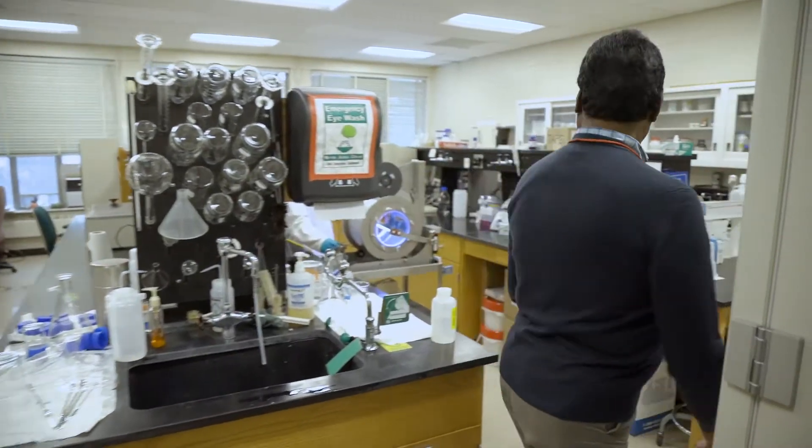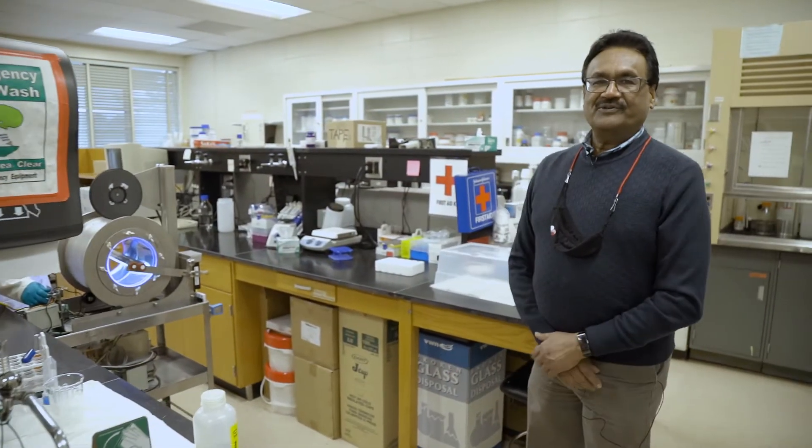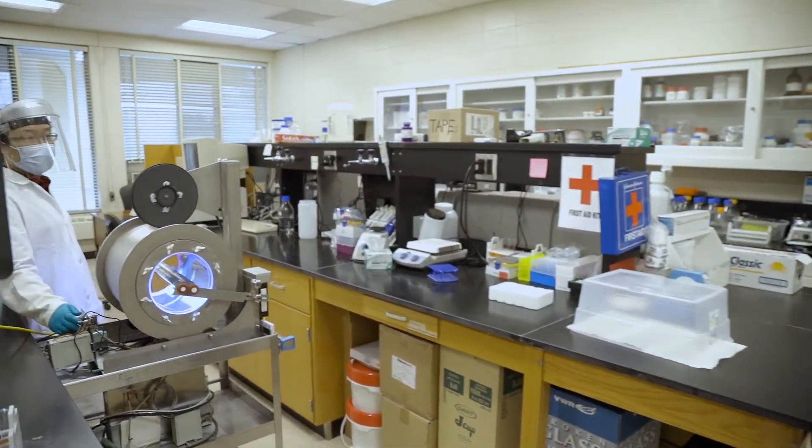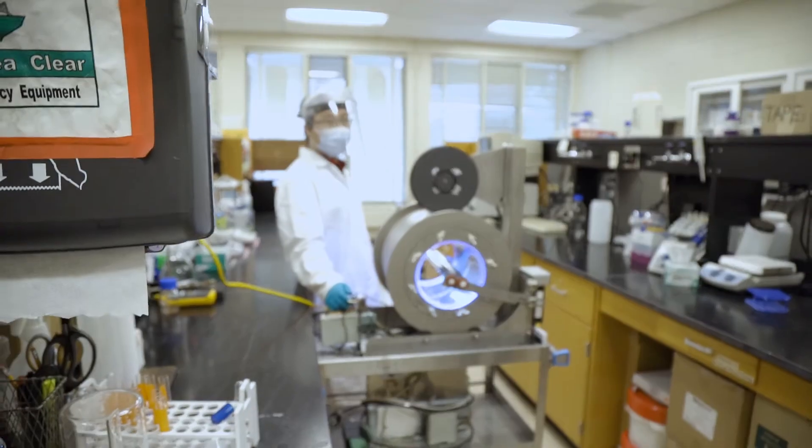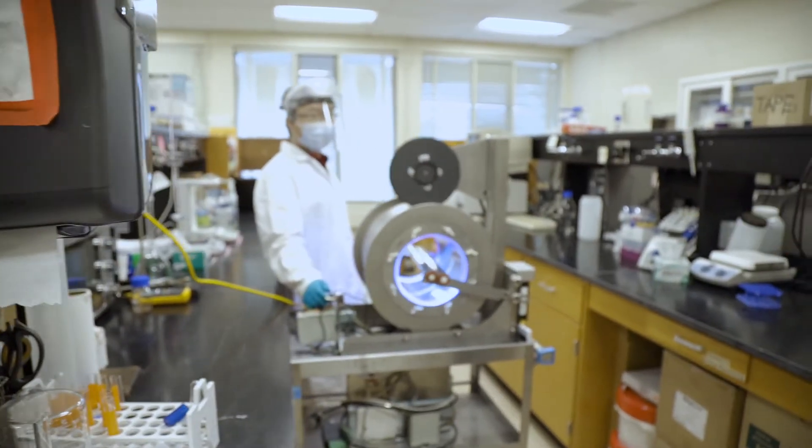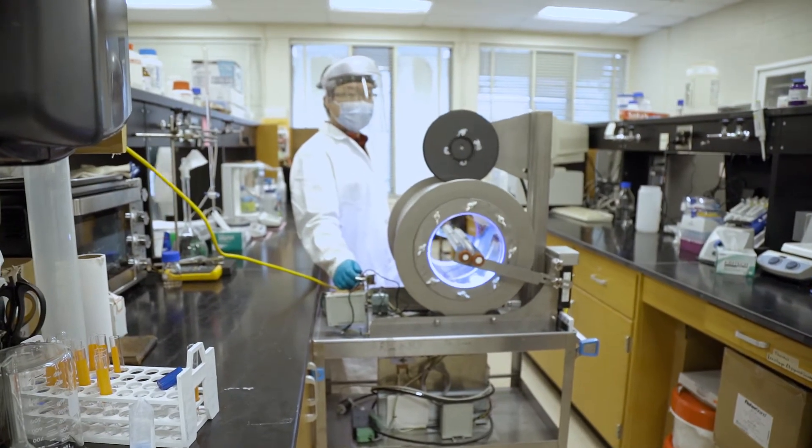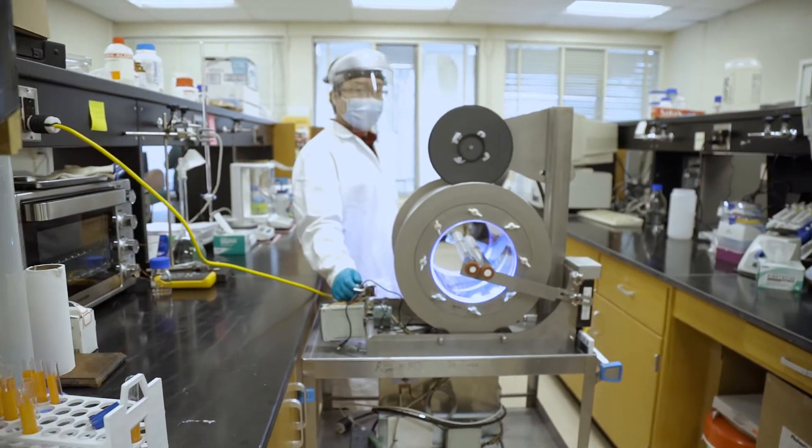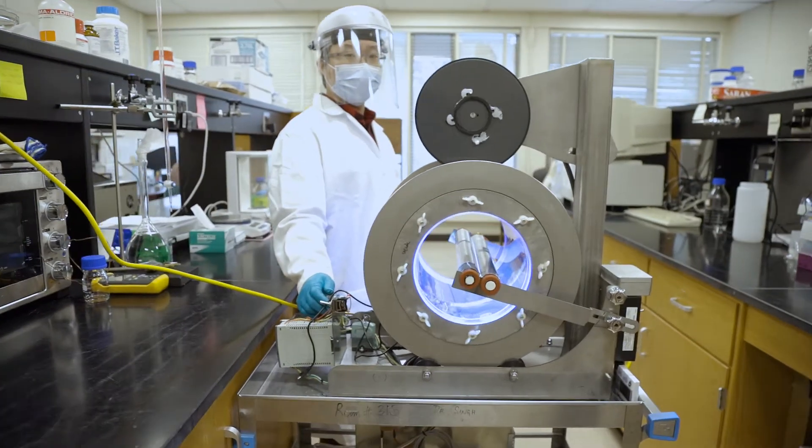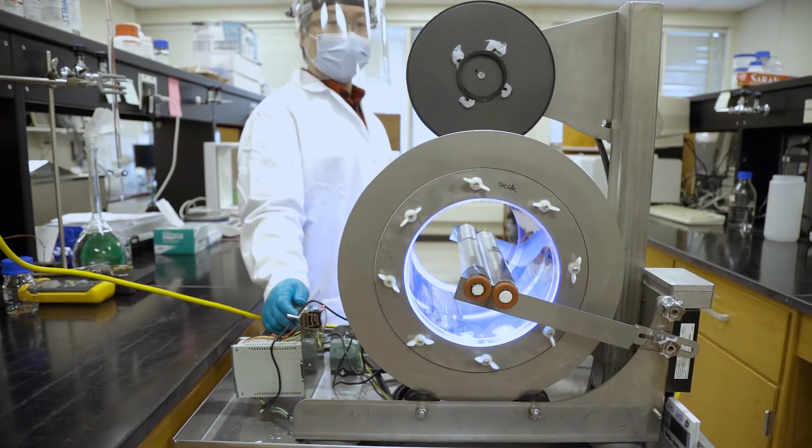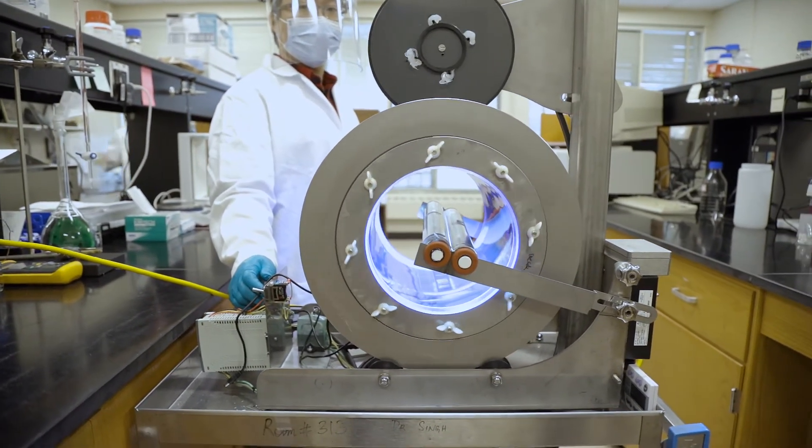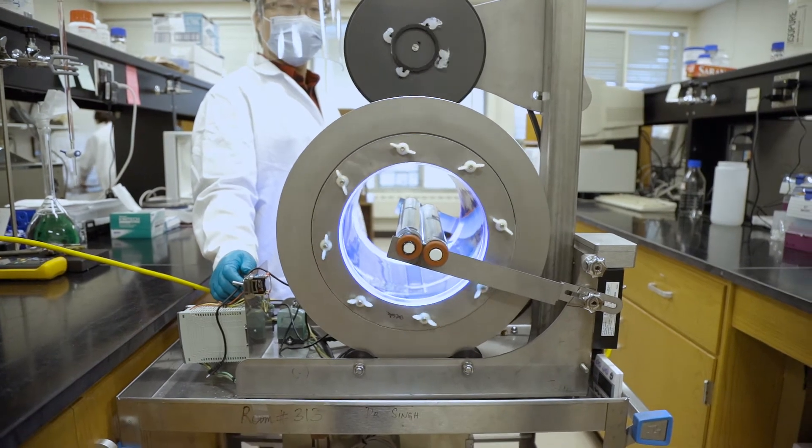The first one is a unit we made for ultraviolet light treatment of peanut samples. We have the ultraviolet light in the middle of the drum and peanuts around it, so it can rotate. That way it will expose all the surfaces and the ultraviolet light is able to disinfect those samples from aflatoxin.